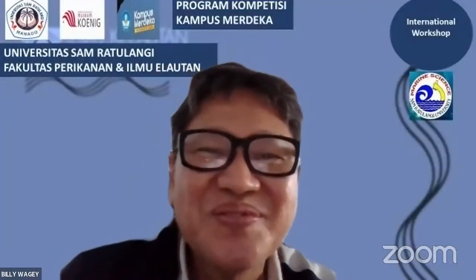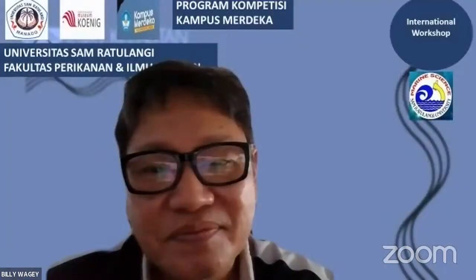So yesterday we started with a cicada, from the family Issidae. James did not know the genus name, no species name, nothing. But we know it's a cicada. So you have to download actually all sequences of the Issidae. He knows it's an Issidae for sure, but which genus, which species? So to make it properly, you have to download all sequences from the Issidae. He has a CO1 sequence, so you have to download all the CO1 sequences from the Issidae.